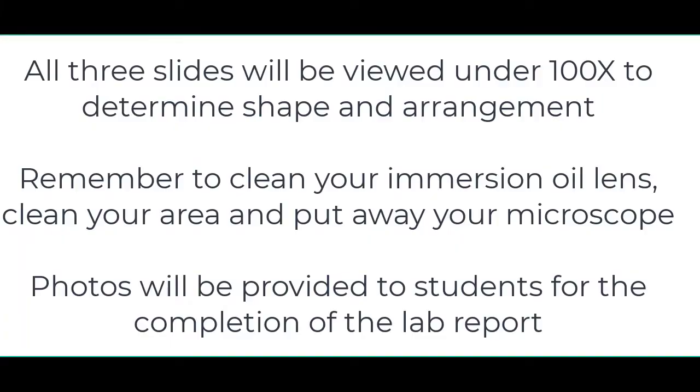All three slides will be viewed under 100x to determine the shape and arrangement. Please remember to clean your immersion oil, your area, and put away your microscope. Photos will be provided to students for the completion of the lab report.